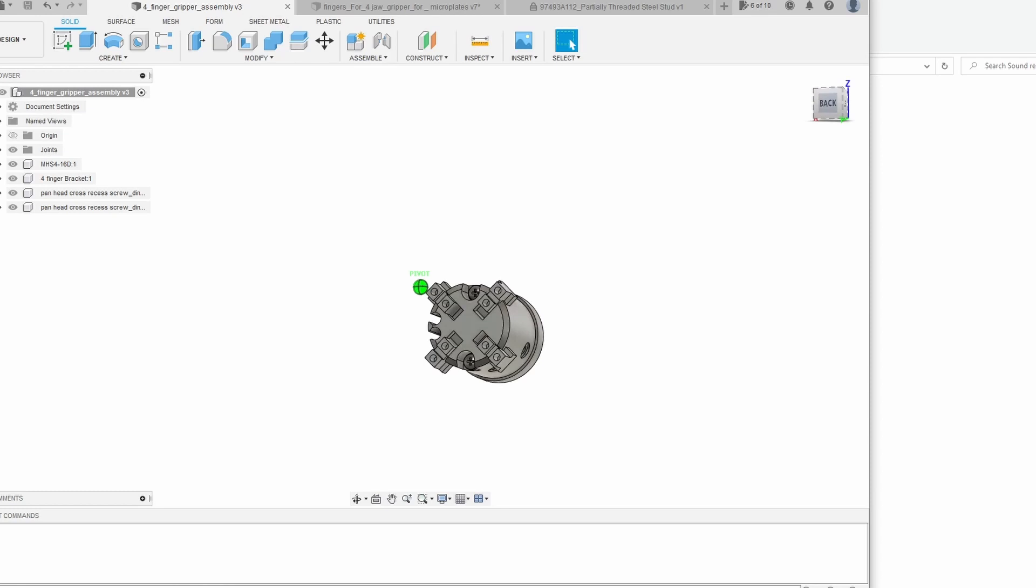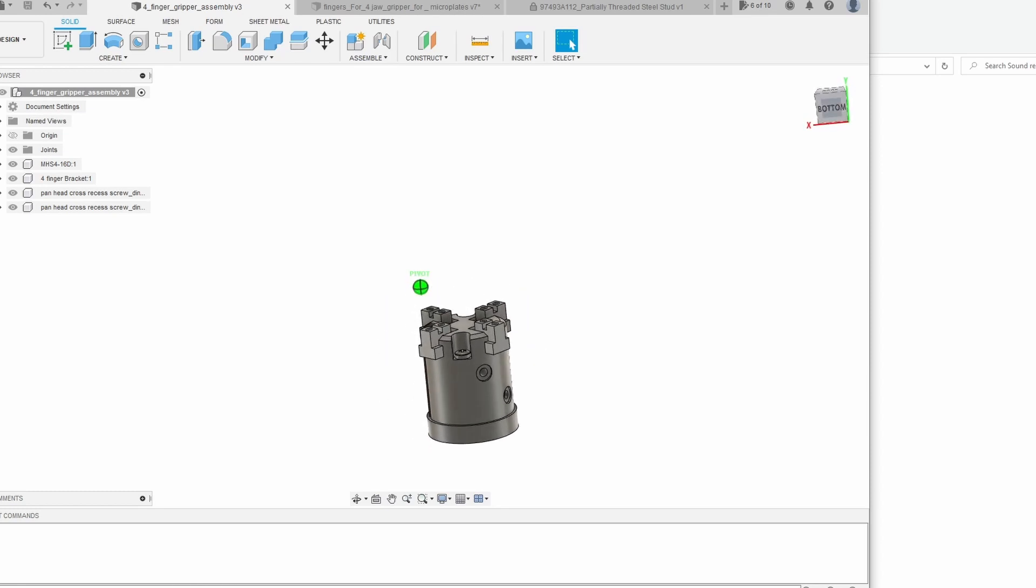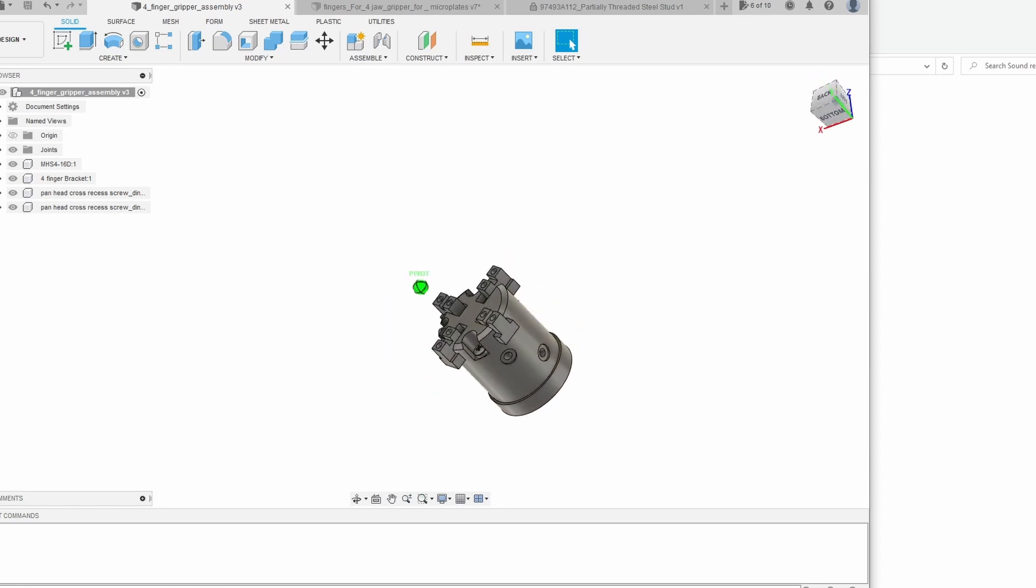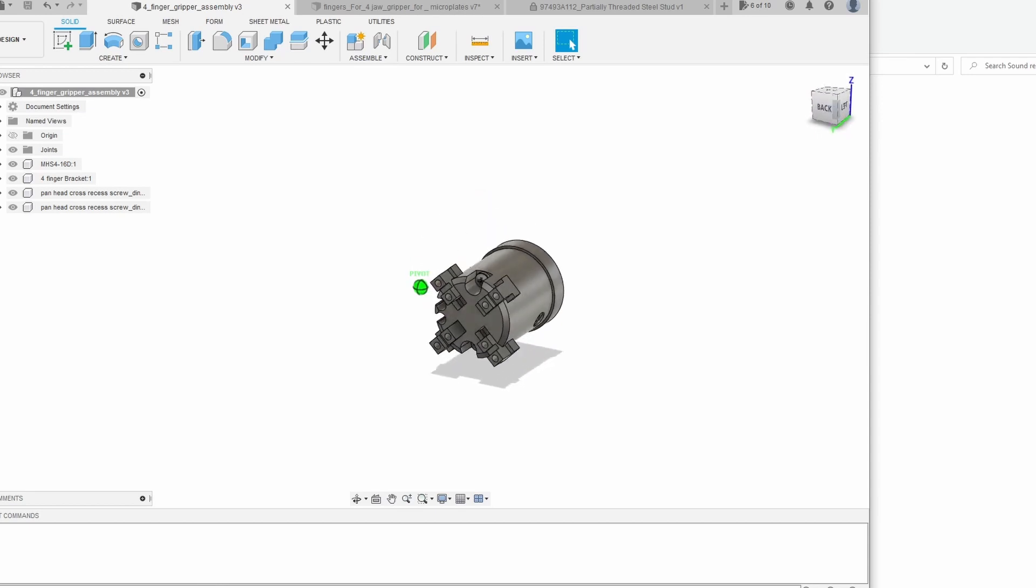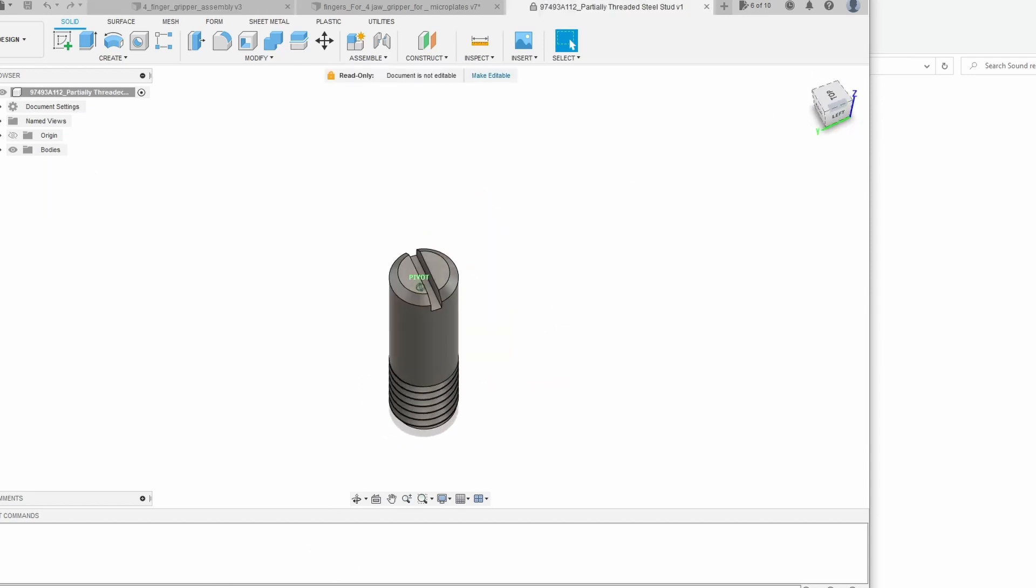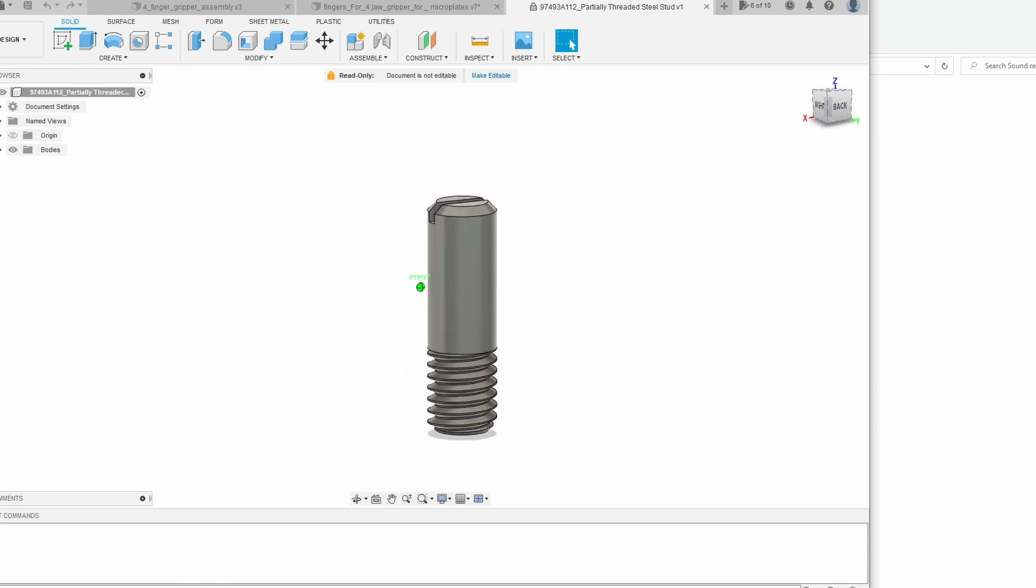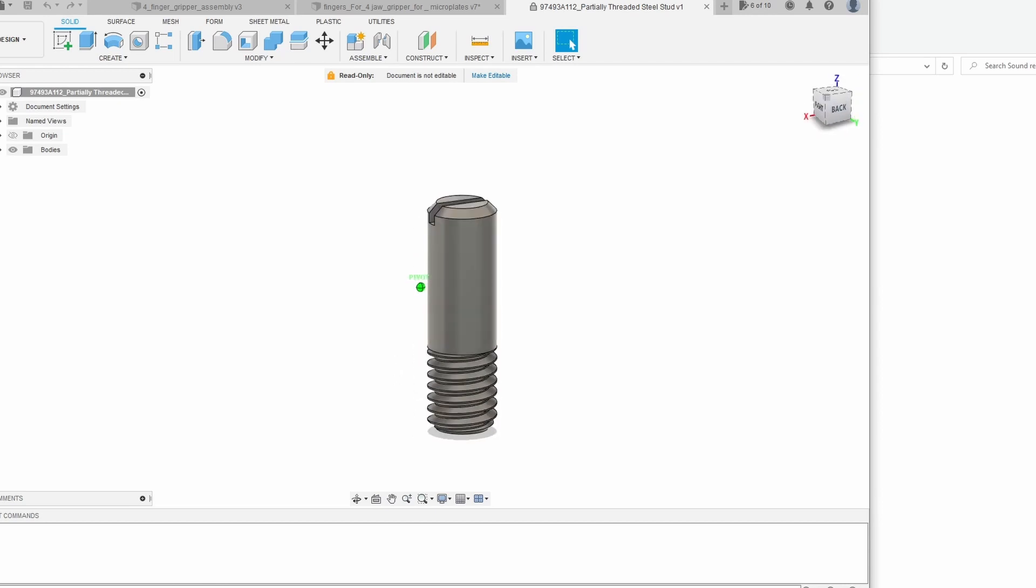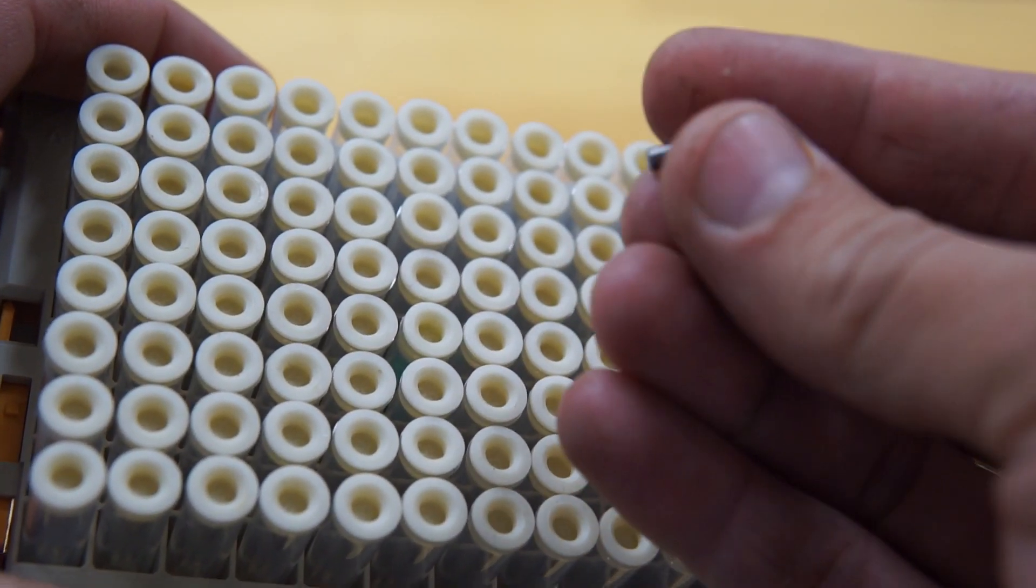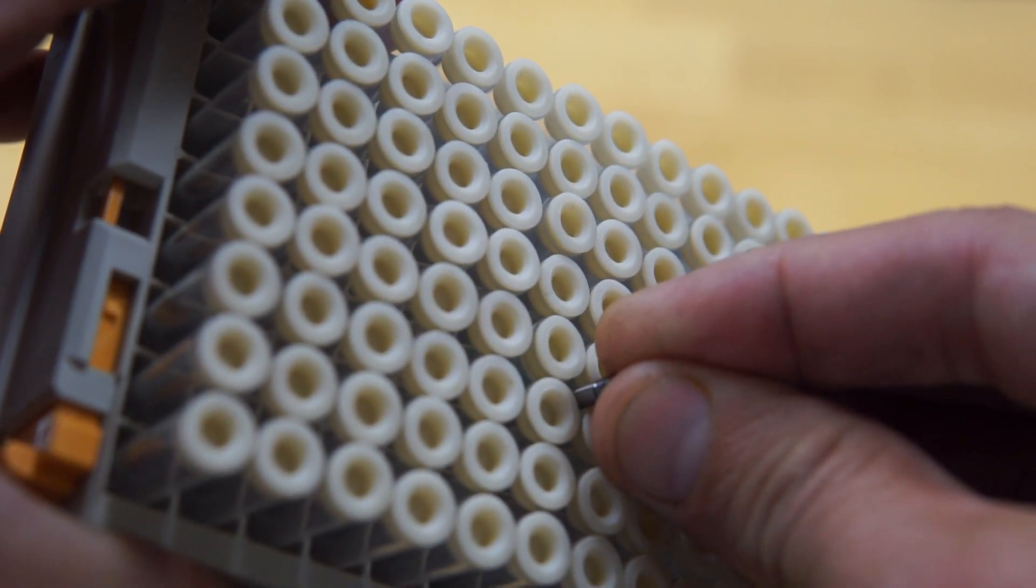For this problem we decided to use 4 jaw gripper so more points of contact will prevent the microtubes from tilting while being picked. For the tip of the fingers we use these 3 mm special screws which can easily fit in the space between the microtubes.